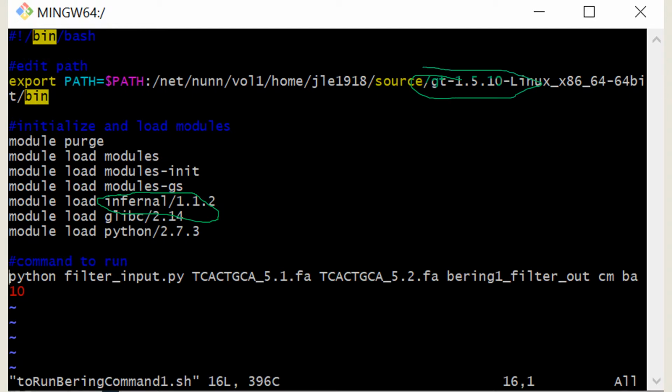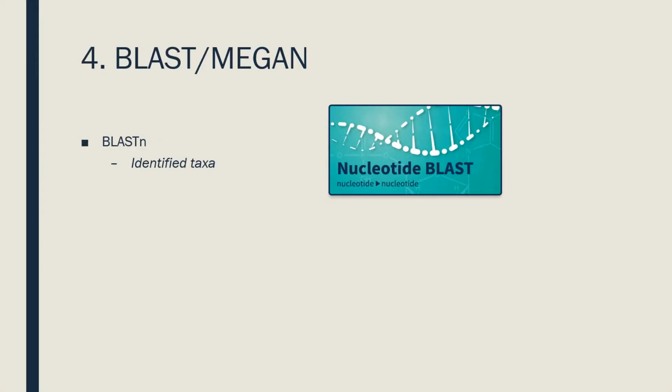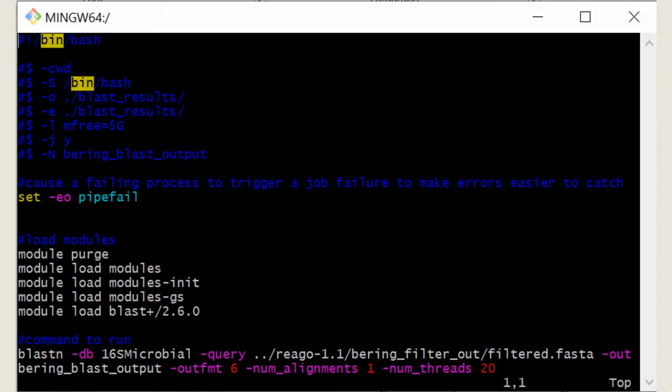The output of REAGO was a file that contained the sequences of all the 16S rRNA genes that the program identified and extracted from the metagenome. While there is a second process REAGO could have ran, it is extremely inefficient. Therefore, an alternate approach was devised. In order to match each sequence returned by REAGO to its taxa, a nucleotide blast was used. This compared each unknown sequence to a database of known sequences in order to produce an alignment file.